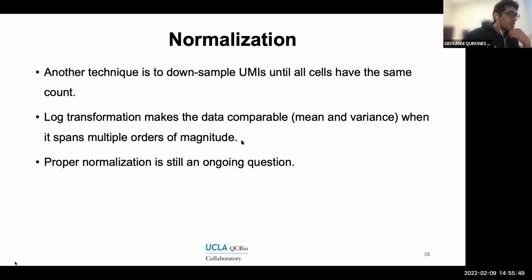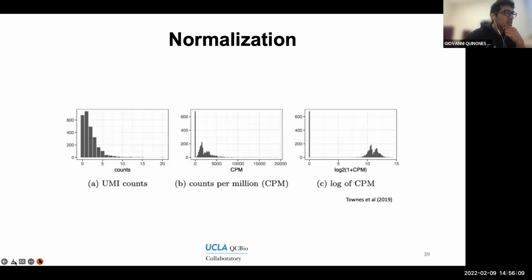So moving on with normalization. Yeah, so we obtain usually the log +1 because, you know, if this value is 0, the log of 0 is not defined. So we just add a 1 as a pseudo count to all the values. And in this paper, they included a very interesting illustration on the effects of normalization onto the data.